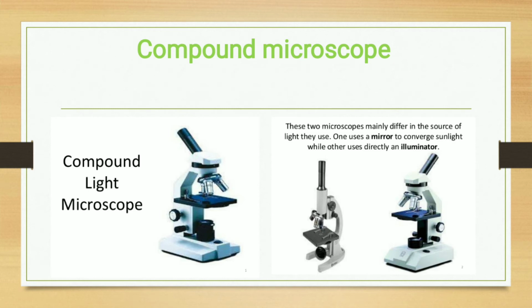Now we study our second microscope, the compound microscope, or simply the light microscope. Recently we call it a light microscope. Compound microscopes are of two types.